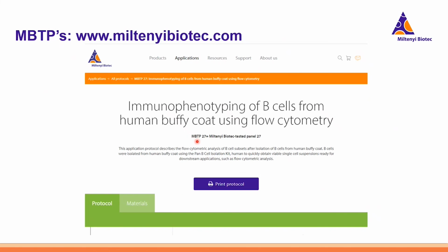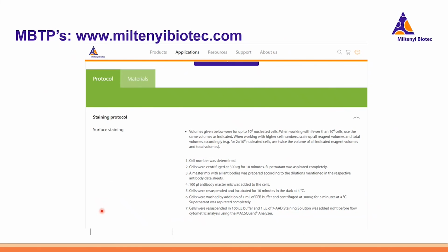When I click on MBTP27, I have the option to print the protocol. We can take a look at the protocol. So when I click protocol, I can see my staining protocol and exactly how to stain the cells, what centrifugation speed, and how to resuspend your cells.